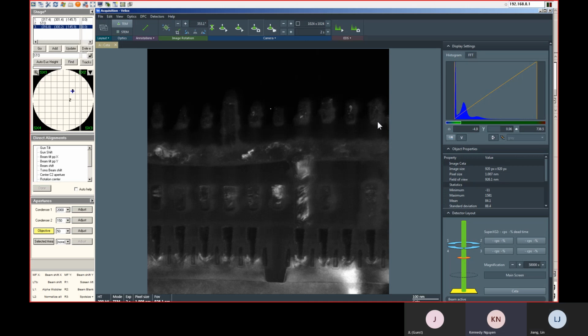Okay. Yeah. Then also, can we briefly go over it? I know usually when you do high resolution, sometimes there's some drifting. Are we going to go over how the drift correction works for that as well? Yeah, we're going to do DCFI to remove the drifting. So yeah, definitely we can go through that. Okay. Yeah. Okay, we're back at the 2 this session. Okay, thank you. You're welcome. See you in a little bit.